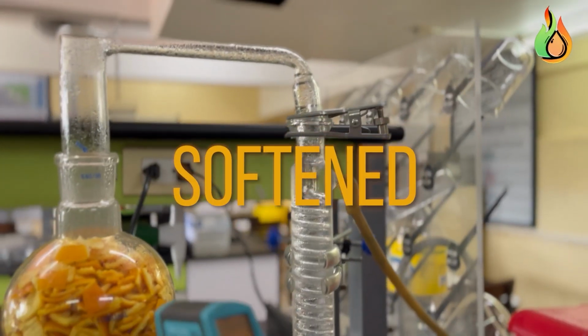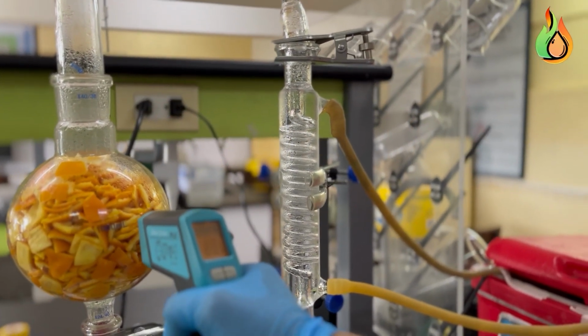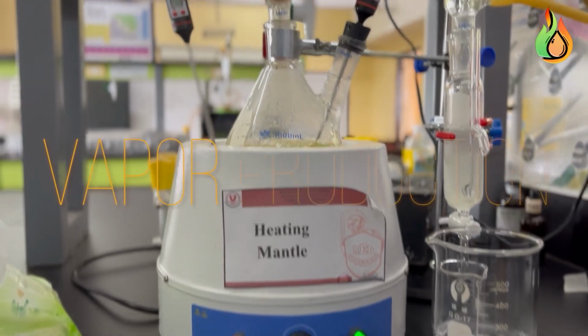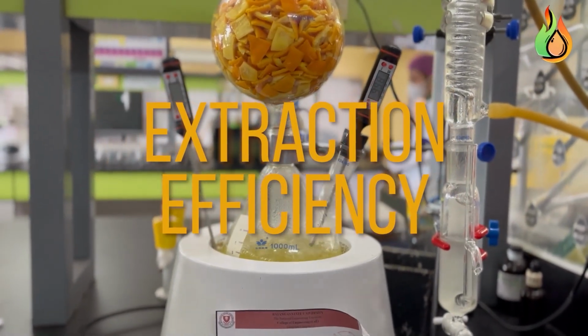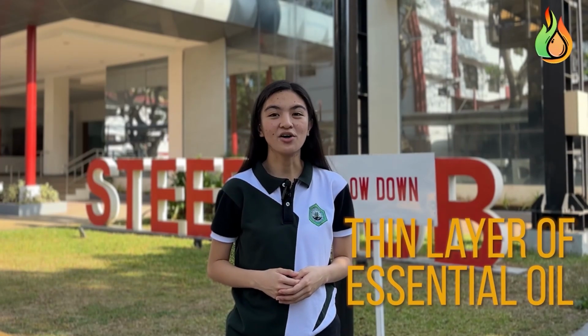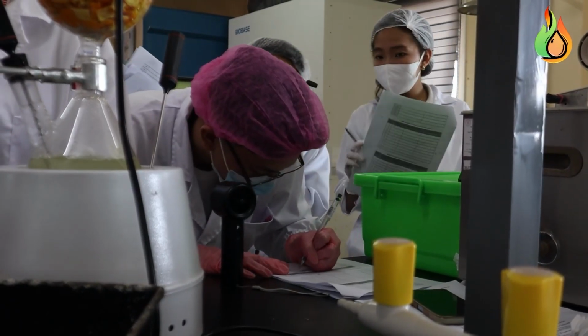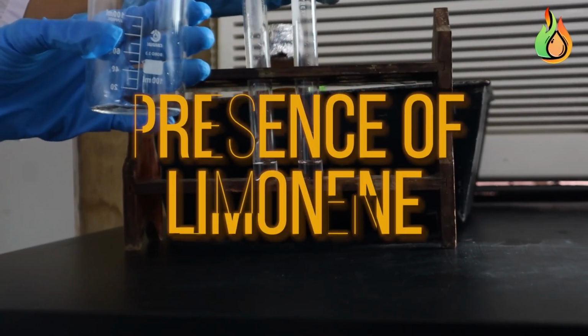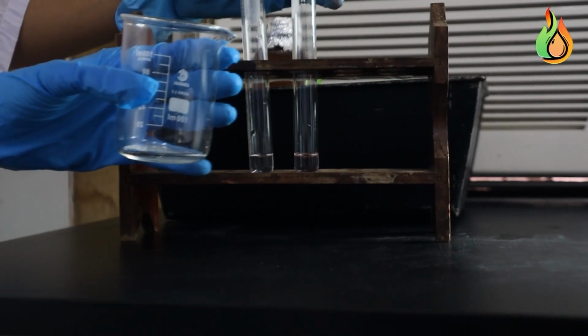During the steam distillation process, the orange peel softened as the essential oil was released, while steam gradually condensed, producing a steady distillate flow. Over time, the boiling water level decreased, affecting vapor production and extraction efficiency. Initially, hydrosol was collected, followed by a thin layer of essential oil on the surface. Furthermore, chemical analysis of acidity, viscosity, density, and presence of limonene confirms the extract's quality.